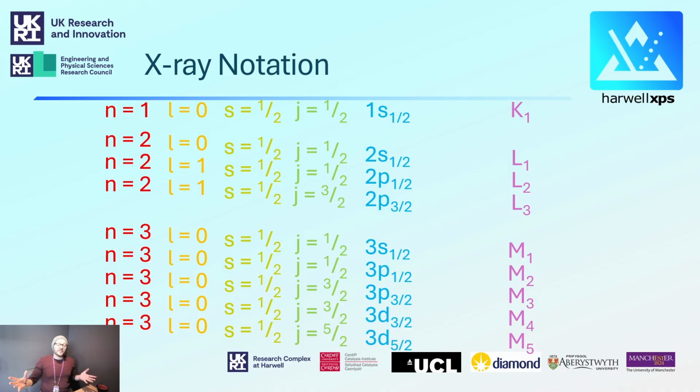So that's Auger-Meitner electrons. They are very useful for some quite advanced topics, and now you know the theory behind how they arise and how we name them.